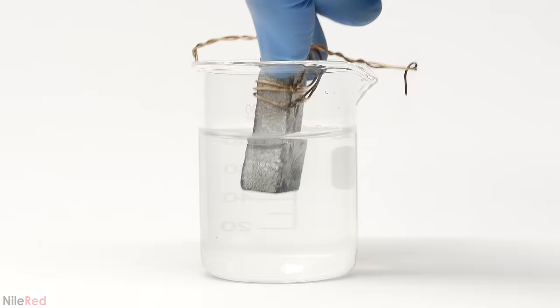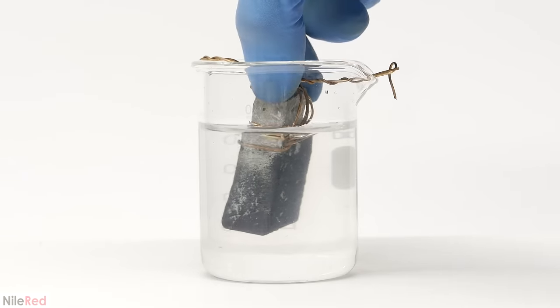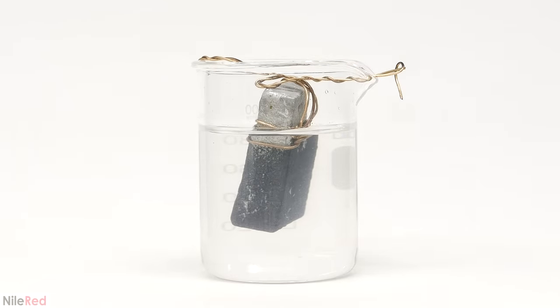I wanted to keep the block suspended in the beaker, so I wrapped it with some brass wire. This way it floats about a centimeter or two above the bottom and gives it space for the crystals to grow.